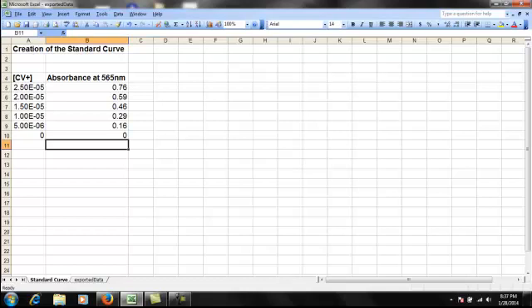If you did do it at 610 nanometers, I would not sweat it. I would use that data and see what kind of results that gives you, and then go from there. I think it will also work out that way, it just wouldn't be quite as accurate for determining concentration at low concentrations because you get smaller absorbance measurements.